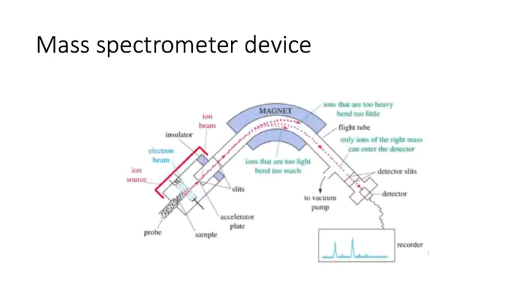The schematic of the device is much like this. First, the molecules are ionized. They get an electron beam shot across them. They lose an electron, and now they're +1. If they're +2, they show up in a different portion of the spectrum, which is usually not measured.